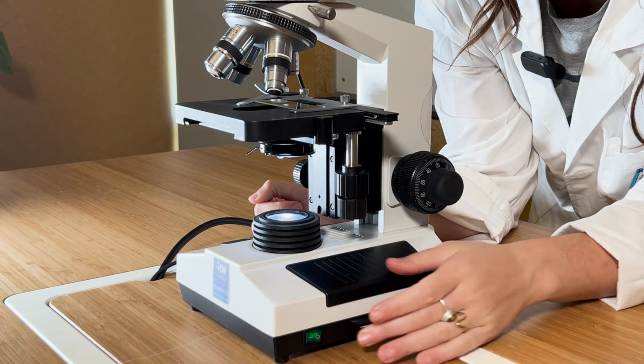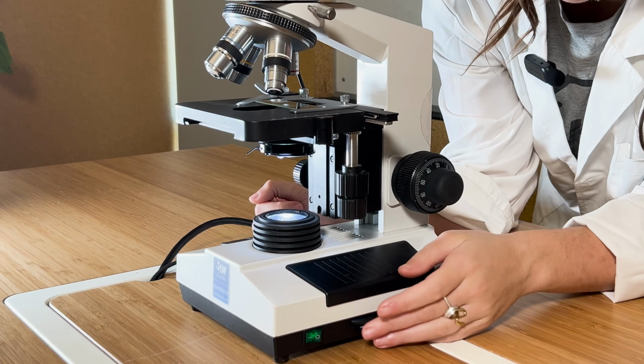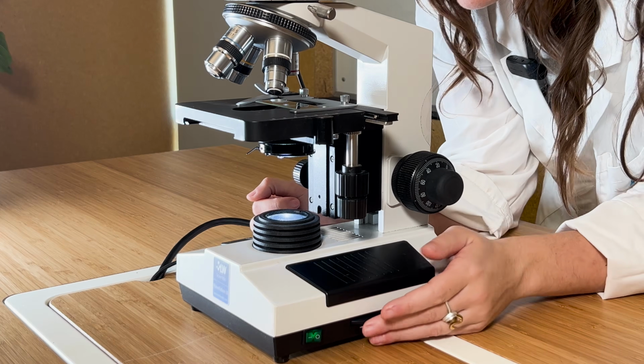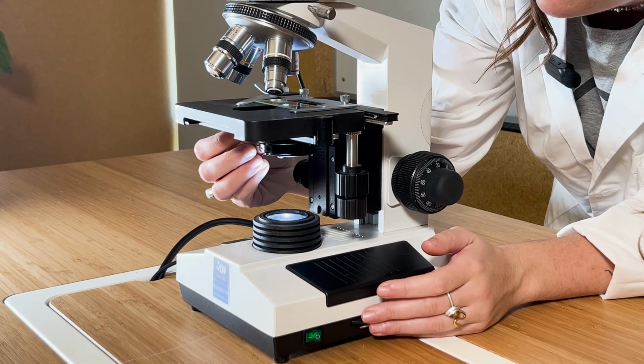You can adjust the amount of light coming through, and there is also something called a condenser, which can provide more dark field or shadow illumination. This helps with illuminating outlines of organisms. You can also control the brightness by adjusting the iris diaphragm.